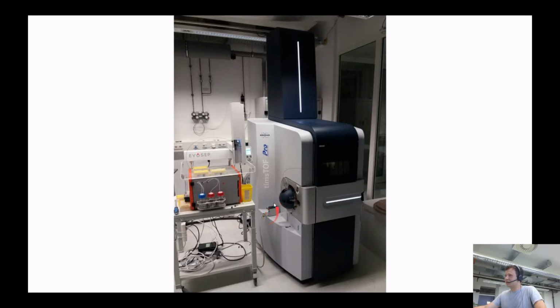We're going first of all to the accelerator, which is sitting here. And this accelerator is pushing all ions on top. And why are these ions not landing on the roof? The reason is that we do have a reflector here on top of the instrument. And this reflector is changing the trajectory of the ions. These ions are going down, back, and going to the detector. And this detector is just detecting how many ions landed on it within the time.